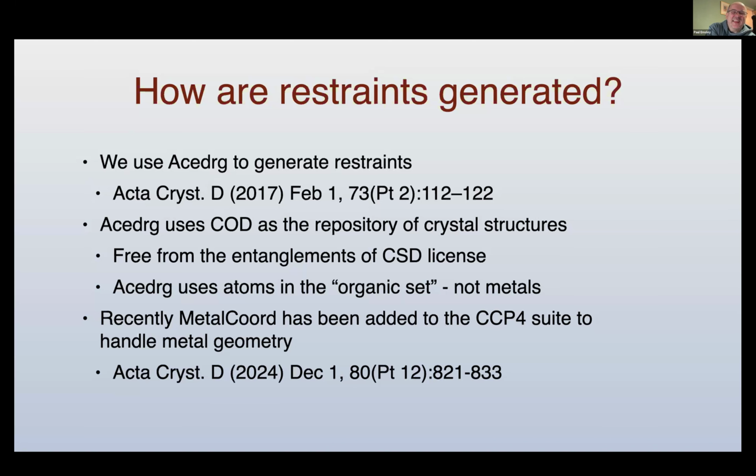Right. We use ACEDRG to generate restraints, and ACEDRG uses COD, the Crystallography Open Database, as a repository, a database of crystal structures. A useful outcome of that is that we don't have to worry about entanglements with the CSD license. They don't own the intellectual property of our structures. That's good, or yours, more importantly.